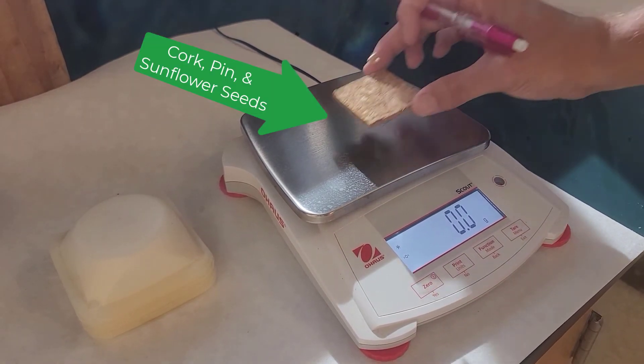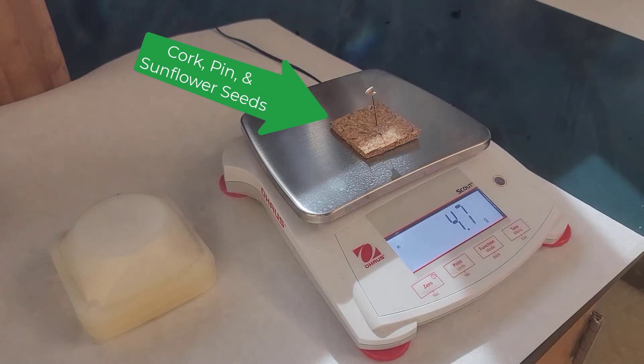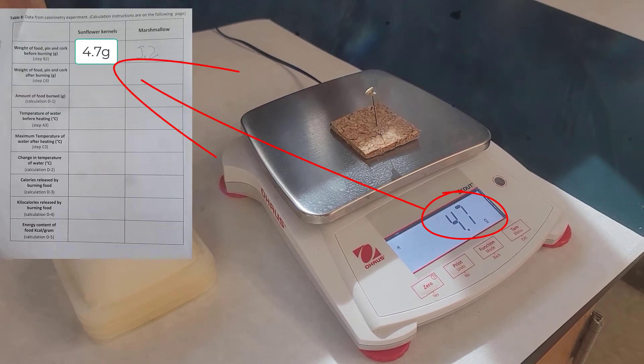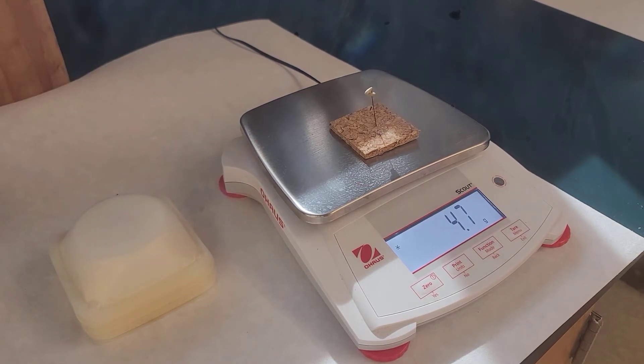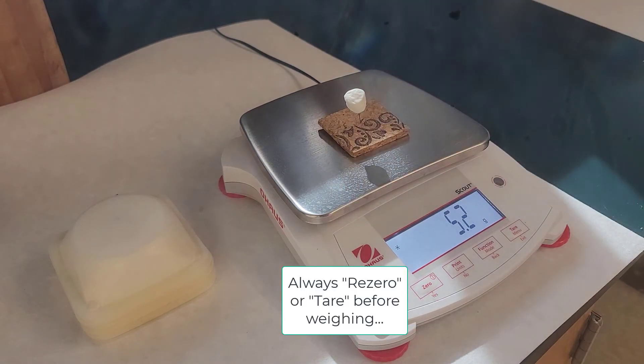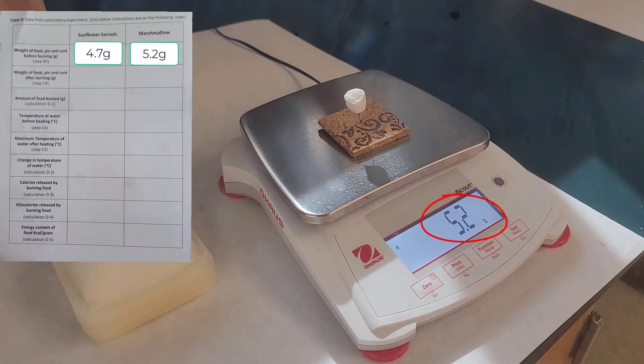We're going to carefully place two sunflower seeds on top of that pin, and then we're going to weigh that whole object—the cork, the pin, and the sunflower seed. Then we're going to do the same thing with a marshmallow. We'll take a marshmallow, put it on top of the pin, and then weigh that.